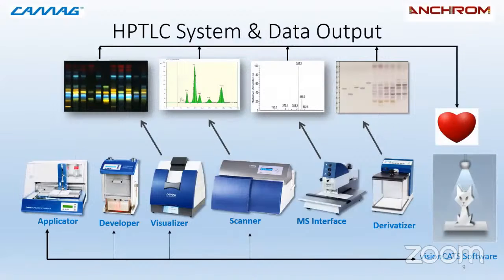Now, this slide represents the complete HPTLC system and the data output which you get from each of these instruments. HPTLC technique is a stepwise technique. You have to follow a certain sequence while going for HPTLC analysis. There are different instruments for different steps. Applicator is there for application, developer is there for development, visualizer is there for photo documentation. By using the scanner, one can go for identification and quantification or further validation.